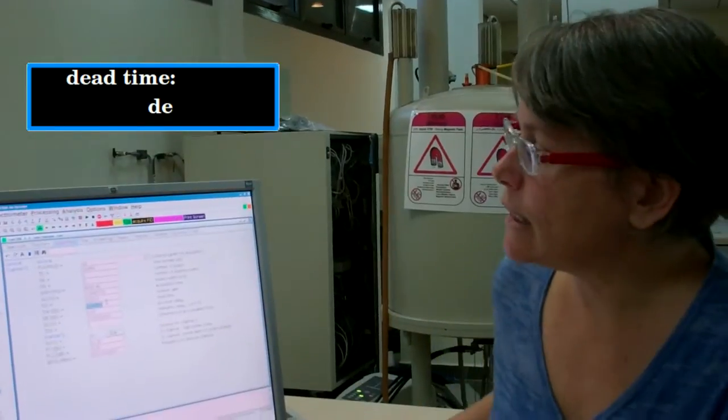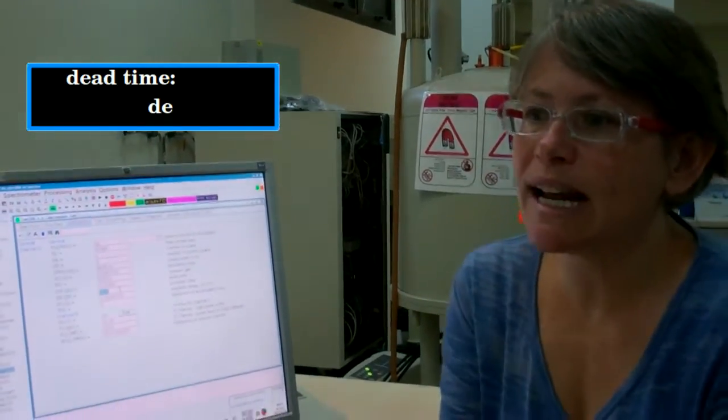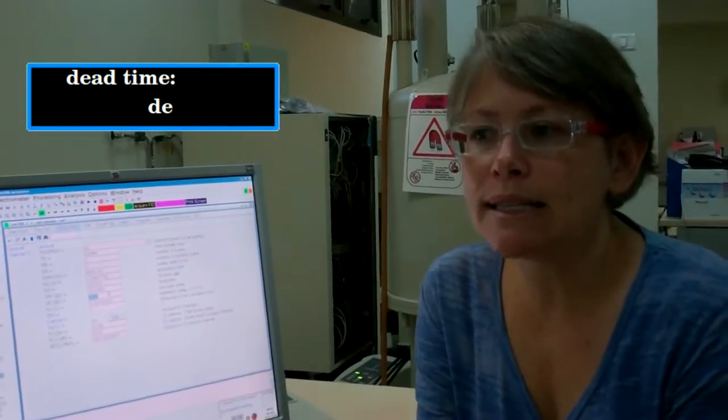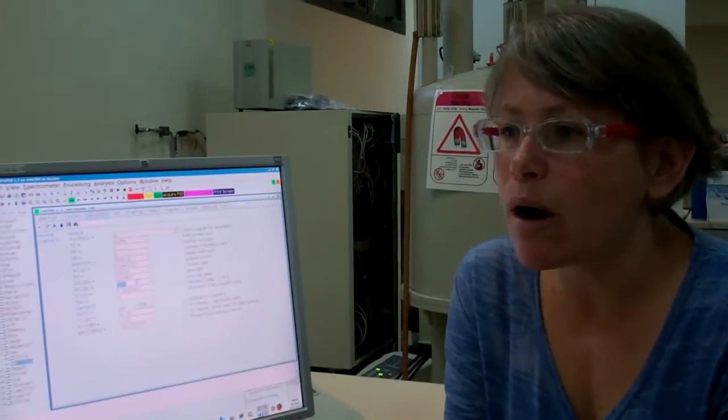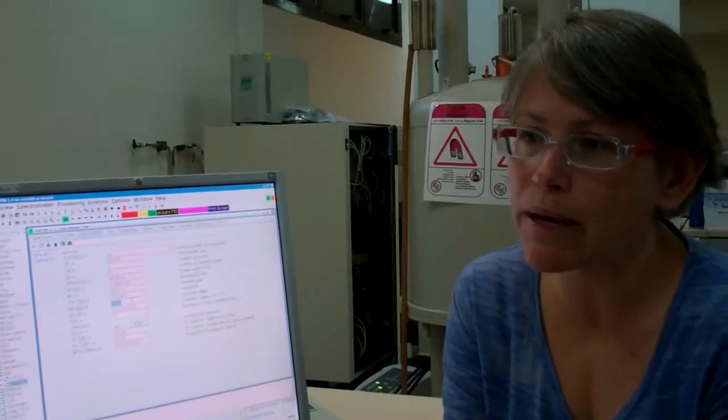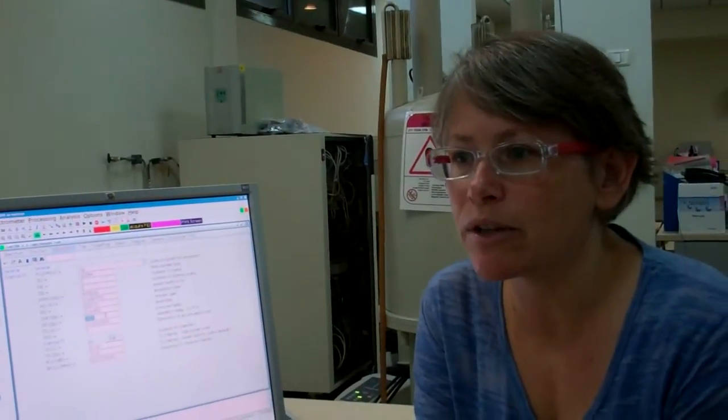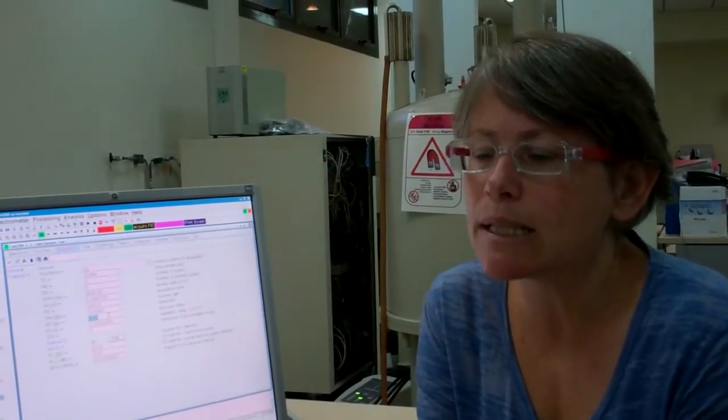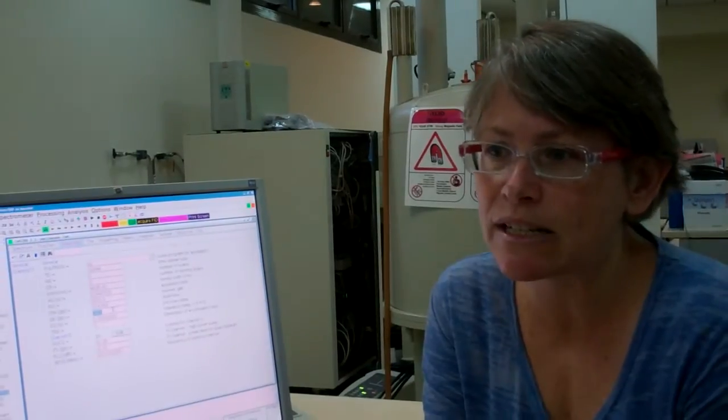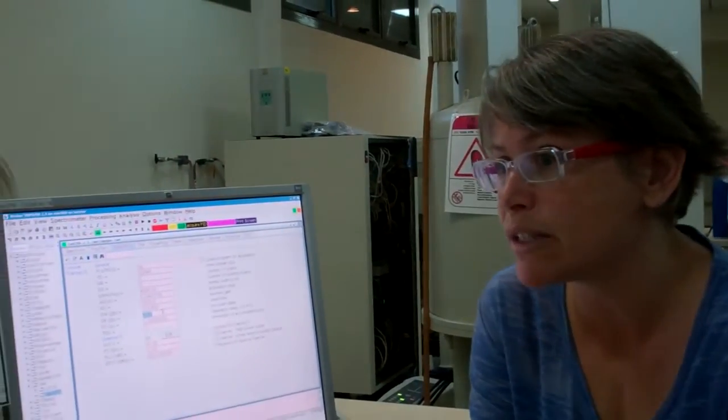The dead time, DE, is usually 6 or 6½ microseconds. The same coil is used for the transmitter and the receiver. After the RF pulse is turned off, there's a spike, called ring down, in the self-resonating circuit. We don't want to digitize the spike, so we'll throw out the first 6 or 6½ microseconds before we begin digitizing the signal every 125 microseconds or so.